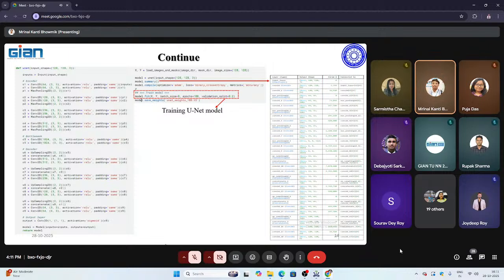I have mentioned it, and the model will learn, yes, this kind of image has this kind of shape of nucleus, whether it is small or large, with the particular image I am providing. With respect to that, I am also providing a ground truth. That will help to extract those particular features through this training, and the model will learn. If the model does not learn, then it will not give me an output.